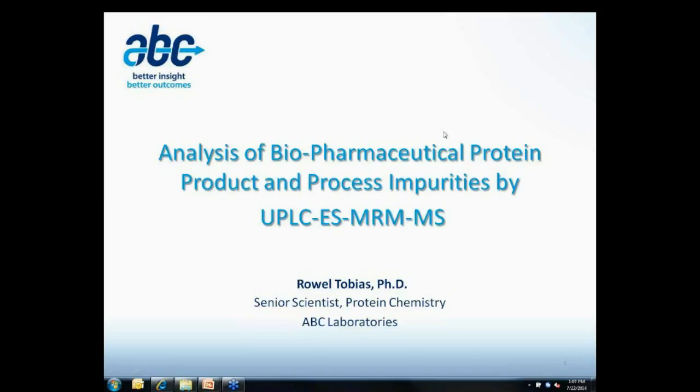Right. Some of the work that we have done at ABC with regards to the determination of product and process impurities by a mass spec-based method called MRM, which stands for multiple reaction monitoring. Sometimes it's called SRM, selected reaction monitoring.